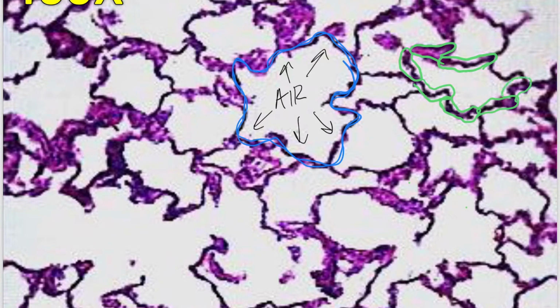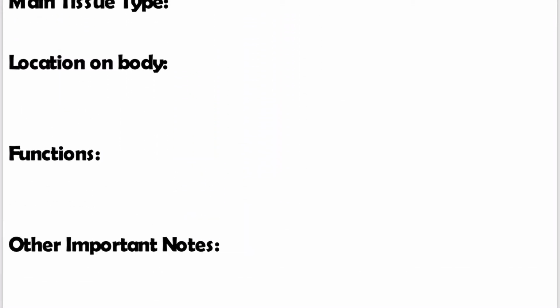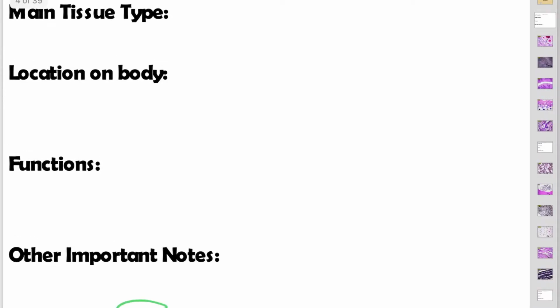But what you actually are seeing is a single layer of cells, but this single layer of cells actually wraps around in 3 dimensions. So most of us can appreciate, this is actually simple squamous, right? They're squished cells and they're in a single layer. Most of us can grasp that simple squamous looks like this, right? Like this. Single layer of flattened cells.